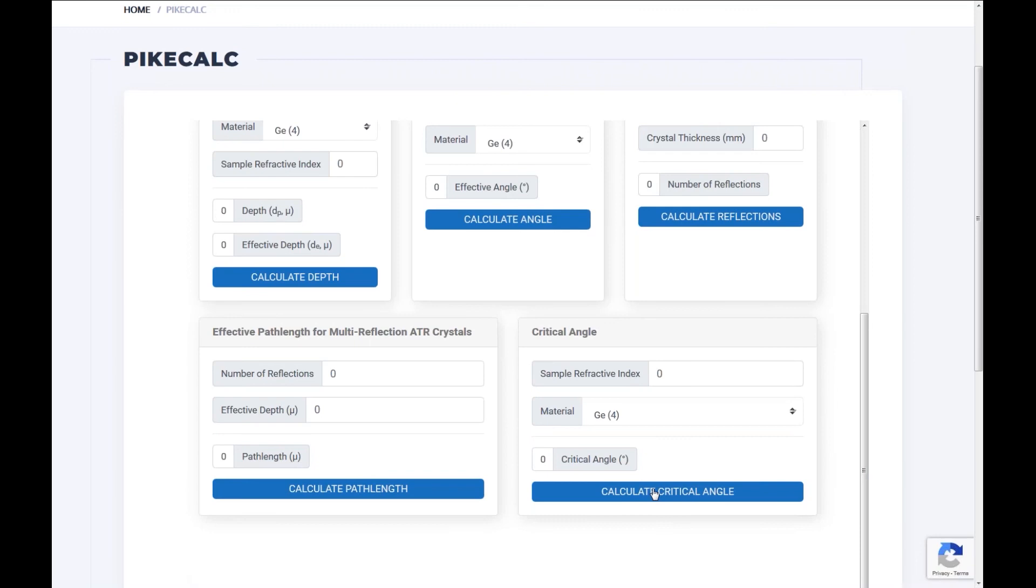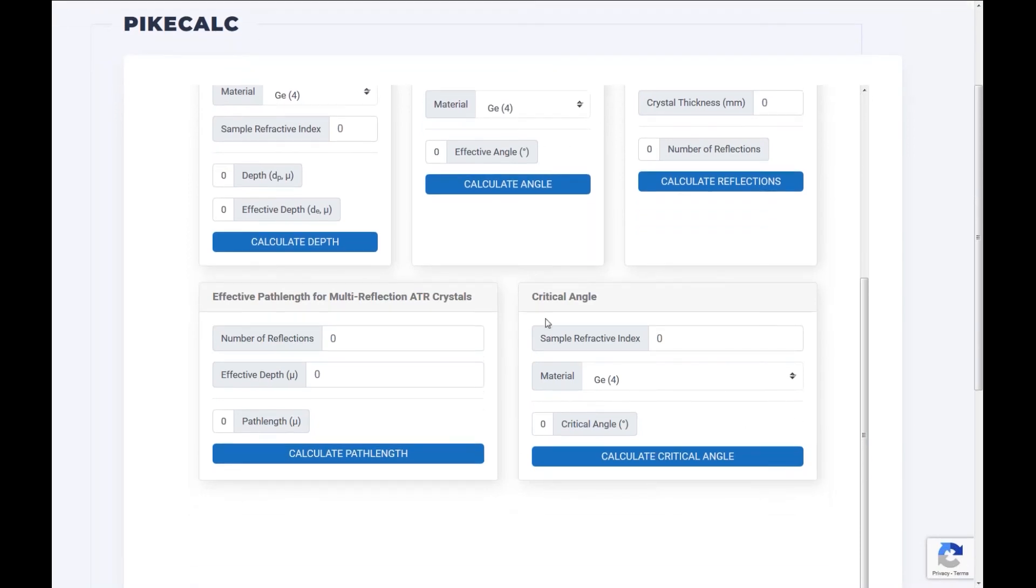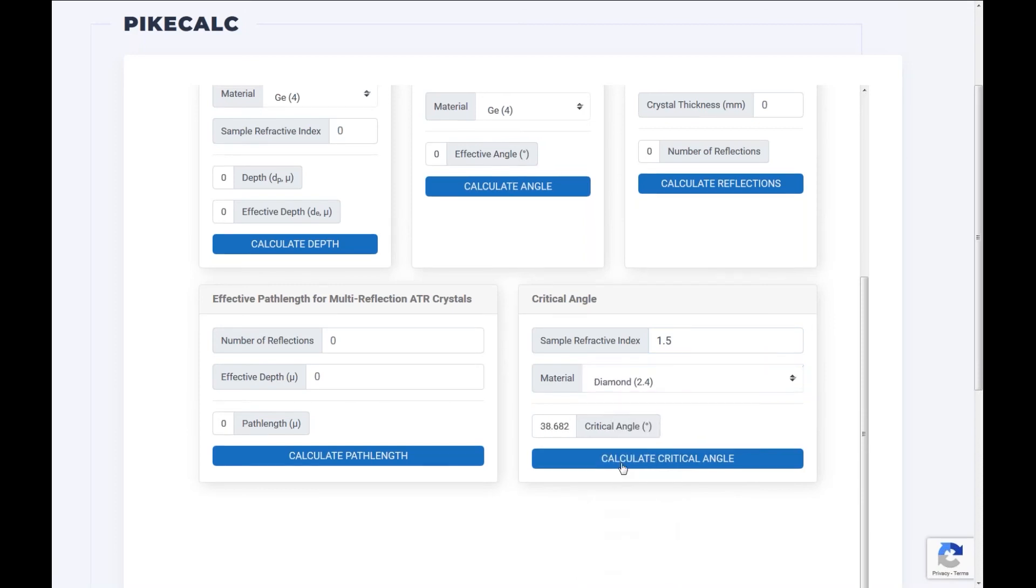Okay. That's the box, the lower right hand side box. So to use this, to calculate the critical angle, we're going to put a refractive index of a sample. A 1.5 is typical for a polymer. So let's just put that in there. And let's look at, say we're using a diamond ATR and let's calculate the critical angle.